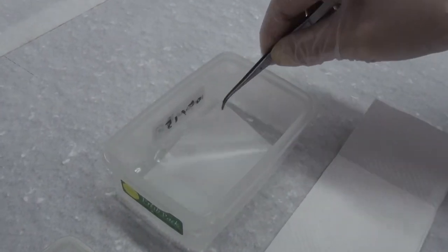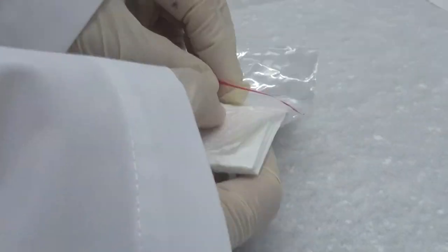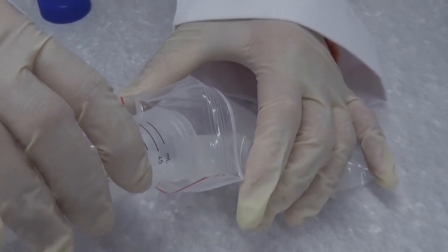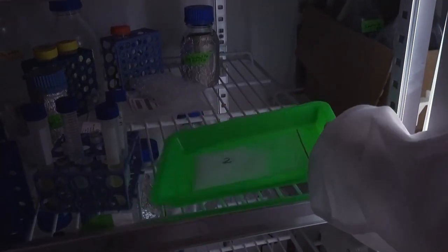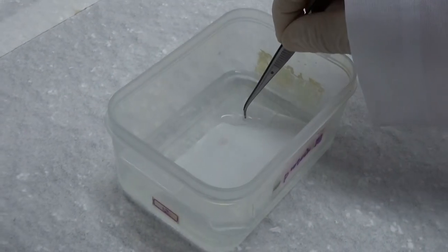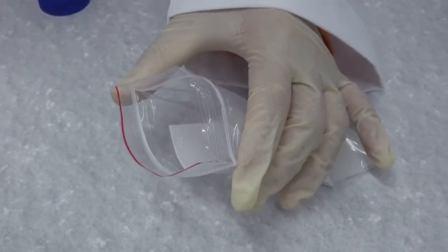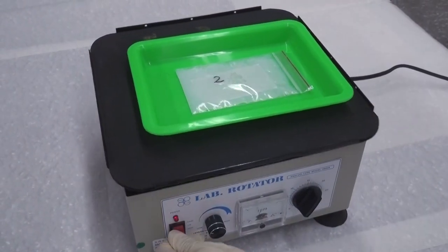If you cannot continue immediately to the second stage, rinse the membrane with distilled water, air dry it on a paper towel, seal it in a labeled Ziploc bag, and temporarily store the bag in a 4°C refrigerator. If the membrane dries during storage, you will have to soak it in methanol again before continuing the experiment. If you can continue immediately to the second stage, transfer the membrane into a Ziploc bag, immediately add 10 ml blocking solution, seal and label the bag, and gently shake it for 1 hour at room temperature.